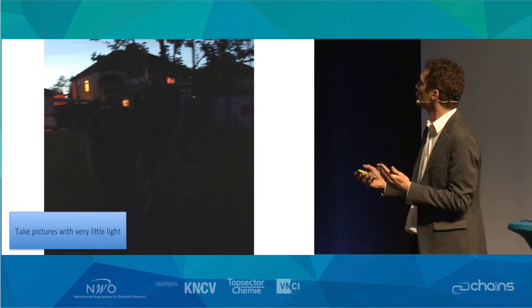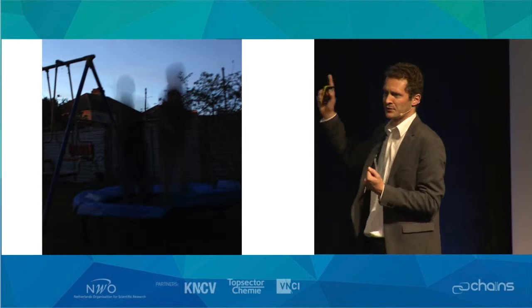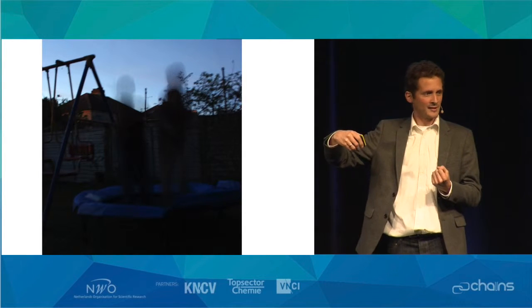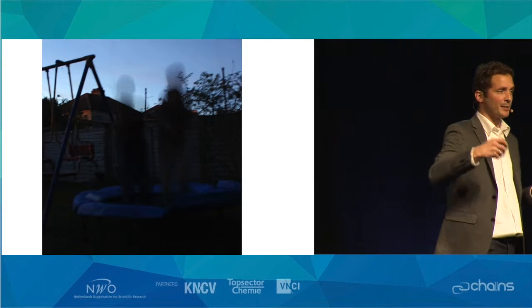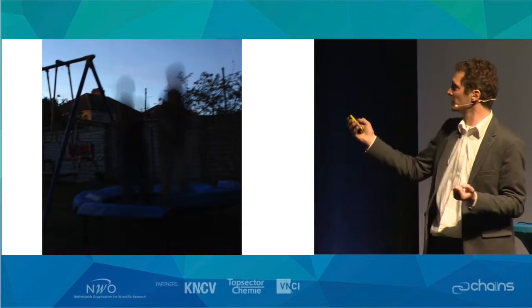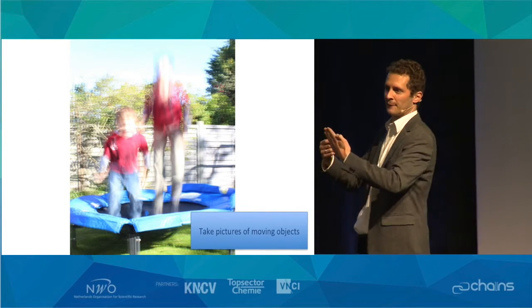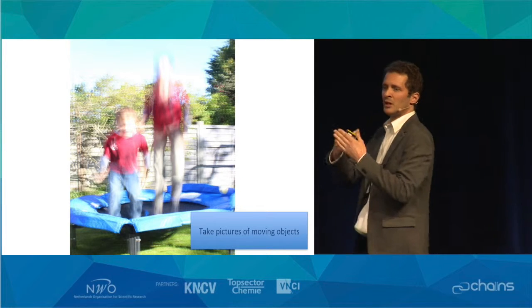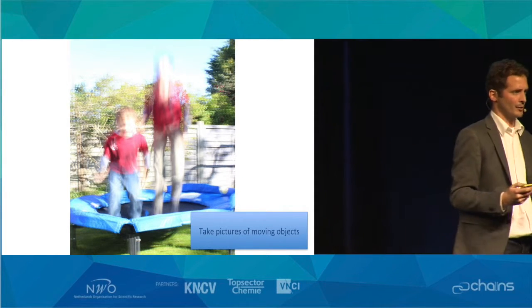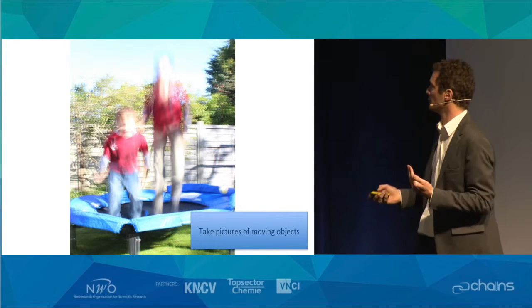Now, this is still an optimistic point of view, because what really happens in a microscope is this. Once the electrons hit your sample, they start to move around. So we're taking pictures in the dark of a moving object. And I'll just switch the light on so we can see what's happening. But if we do this on our normal photographic film and a half-second exposure, we'll of course get a very blurry picture. And that happens exactly the same with the molecules in our microscope. The electrons hit them, they start to move around.